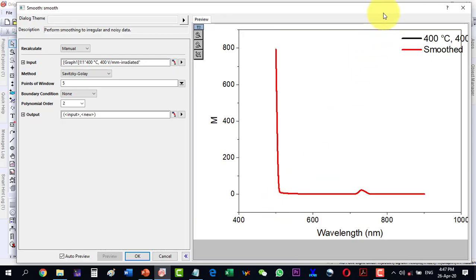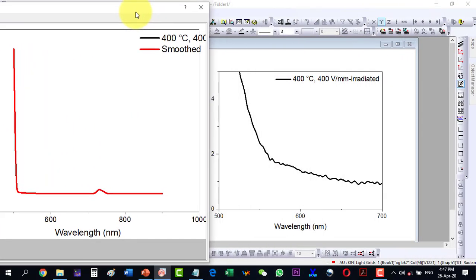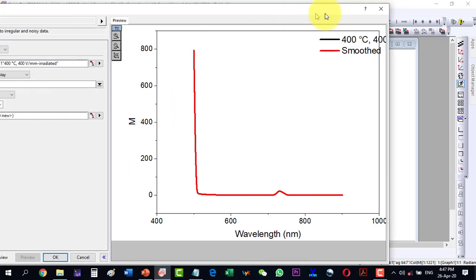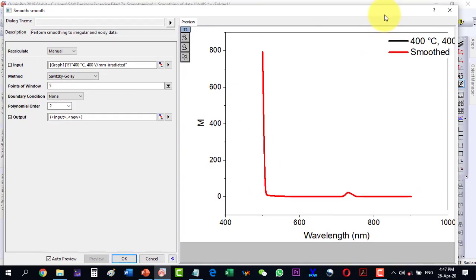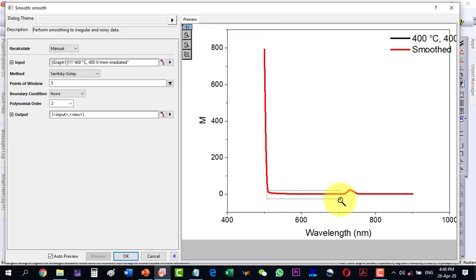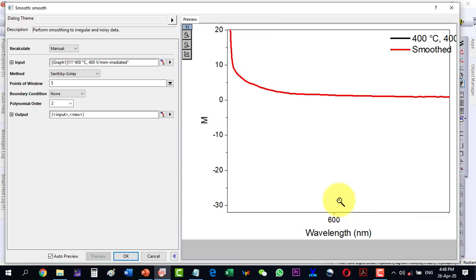As I enable Auto Preview it is showing me the whole plot, so I will have to zoom into the portion of interest, which is from 500 to 700 on the x-axis and up to 4 on the y-axis. Let's zoom into that portion using the zoom tool.